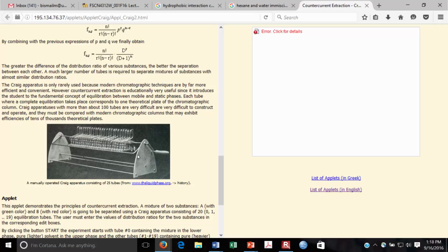And then he puts the sample in the first tube, and there's water, and then hexane, and then there's a shake, shake, shake, and then the content of the first tube is spilled into the second tube. But however, the lower part of whatever was in the tube, the water, remains in the first tube. So only what gets spilled into the next tube is your organic phase.